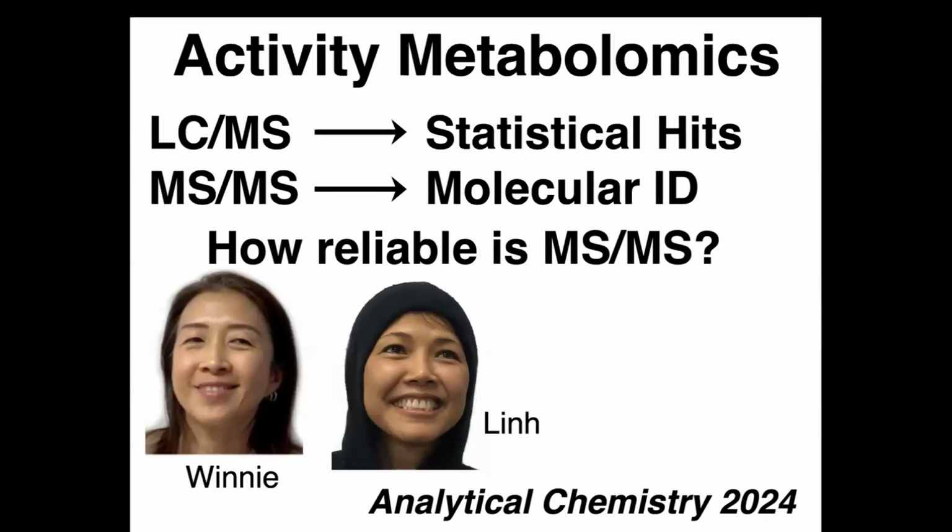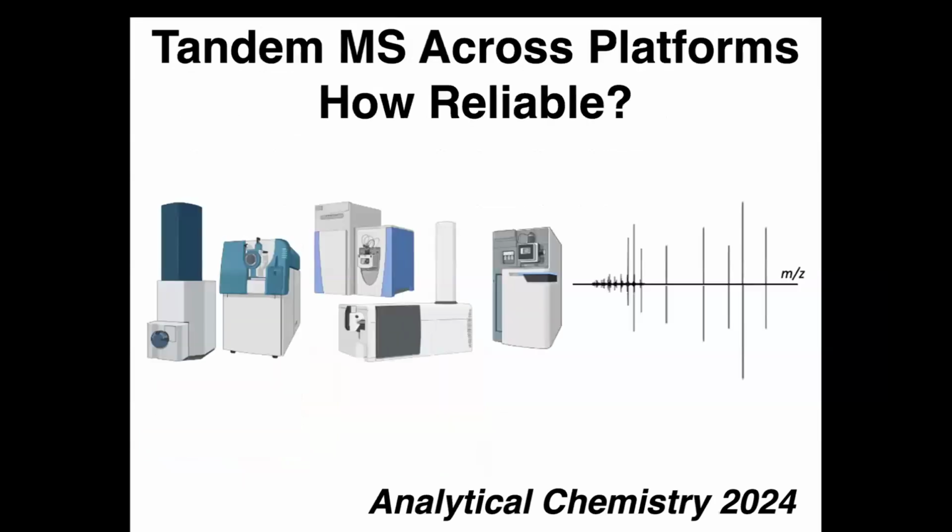How reliable is MSMS data? And I should say Corey Wang was also one of the lead authors on this particular study. So what we did was we looked at MSMS data across 5 different platforms, which it's fortunate that we have available to us.